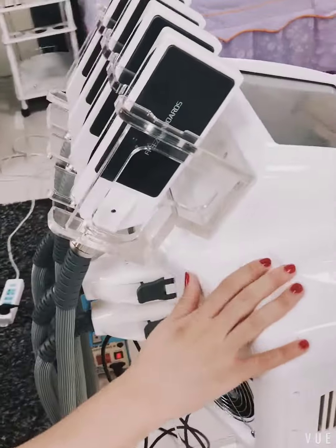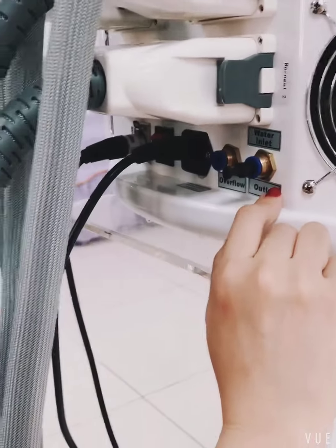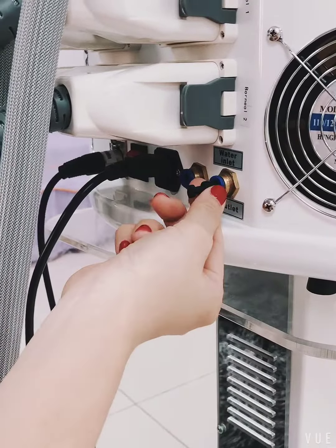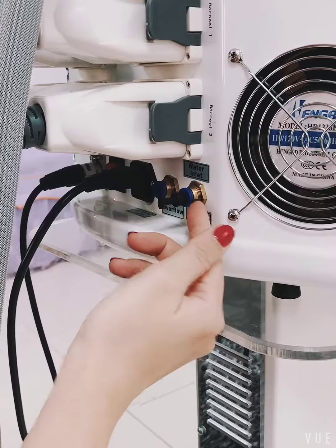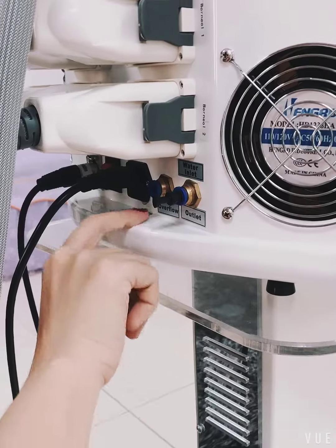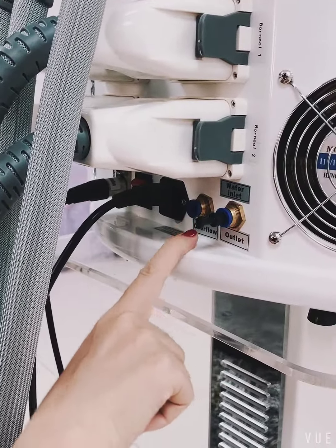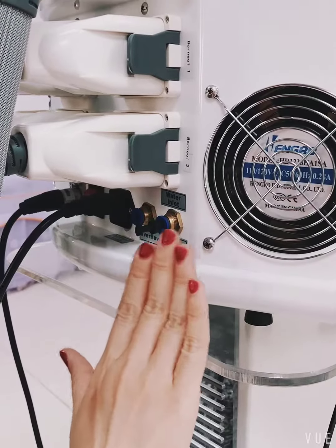Before we turn it on, we need to fill water into this machine. This is the water inlet and outlet hole. Take out this stopper and fill water inside this hole. When there are a few drops of water that come out from the overflow hole, that means the machine is full.